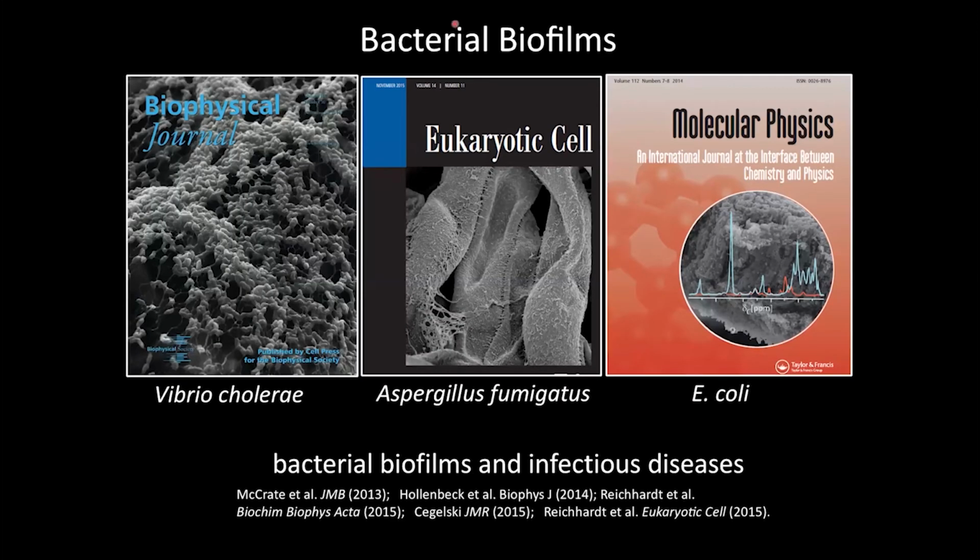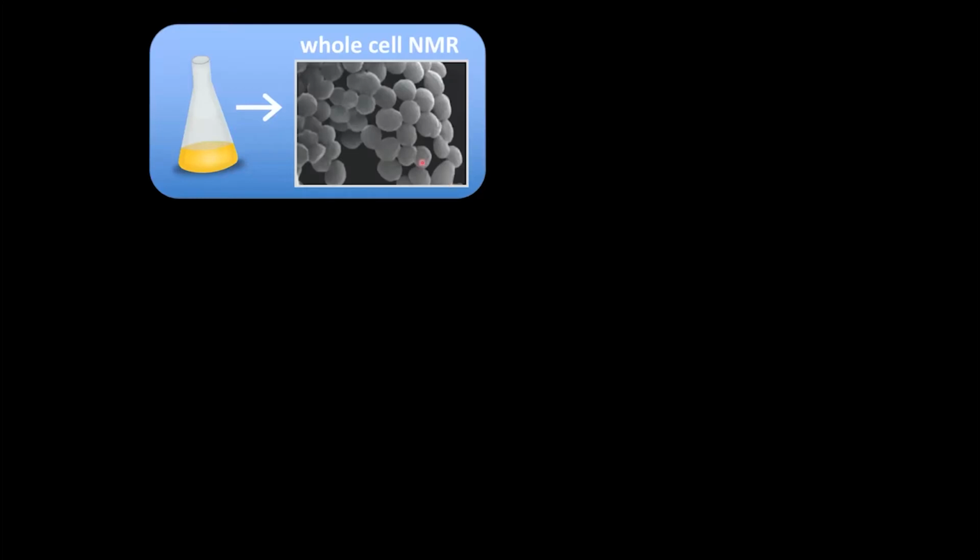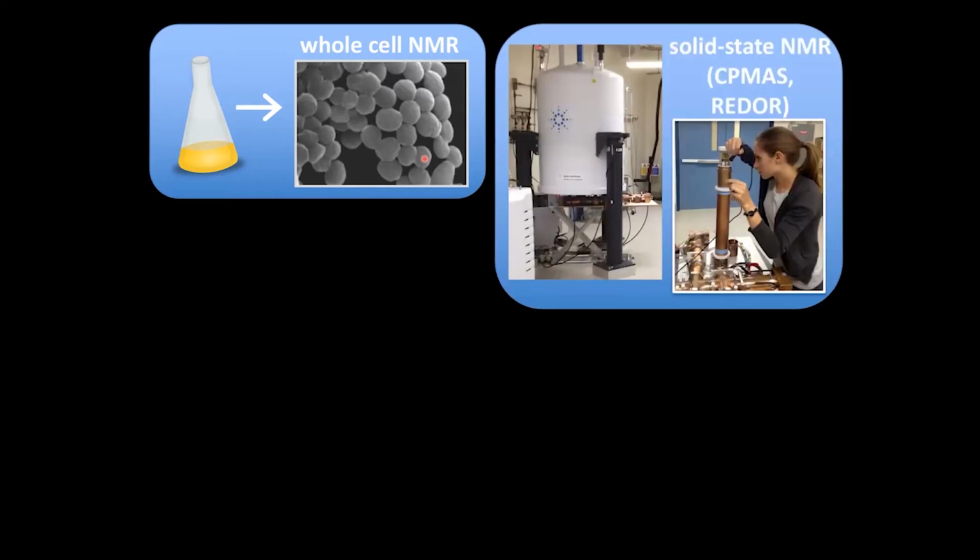And I'm going to tell you about our work on bacterial biofilms. We couple NMR with a lot of biochemical techniques and microscopy, which always makes for pretty journal covers. You can tell those were more biological journals, but this one was in molecular physics, where we were able to smuggle in an actual NMR spectrum onto the cover. We were glad about that. In our lab, we've been trying to push the envelope on using solids NMR, not really for individual protein samples, but for these complex collections of materials, pushing the envelope on whole cell NMR, extracting specific information about the cell wall or even ribosomes.